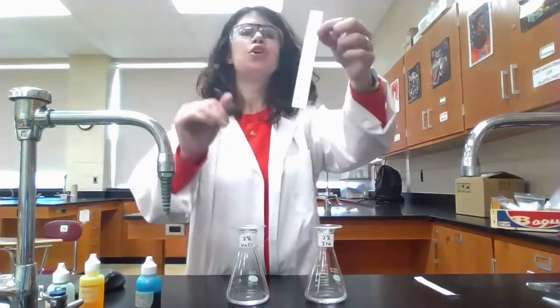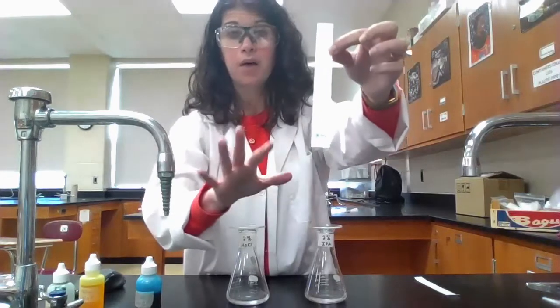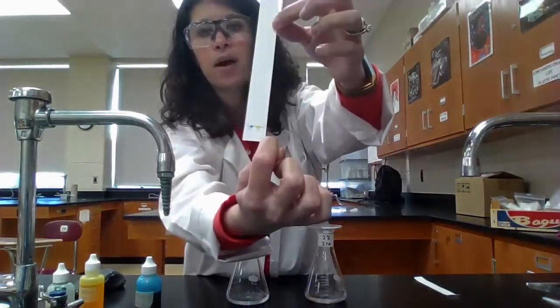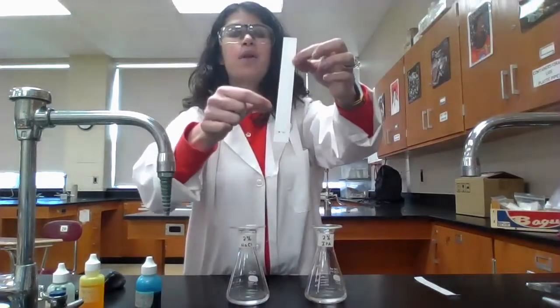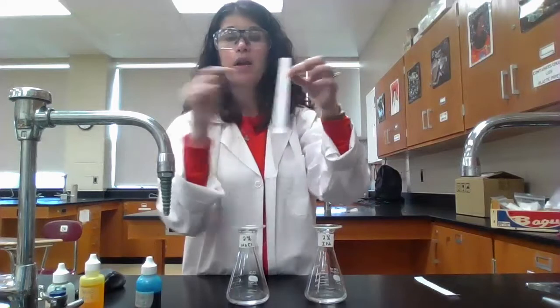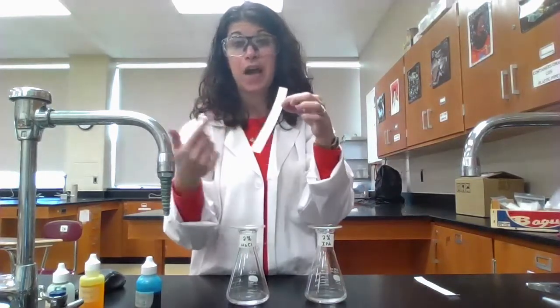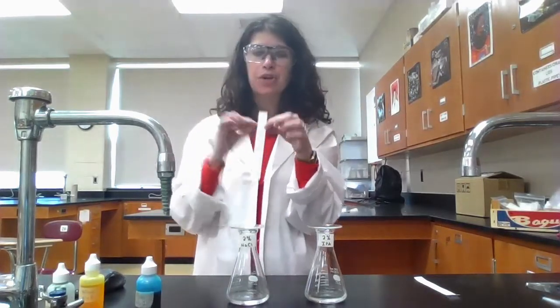Once the paper is in, it's really a question of being patient and watching the solvent travel. On the paper, I drew a line with pencil — not pen — to mark the starting point. When I take it out of the chamber, I'll also use a pencil to mark how far up the solvent traveled and how far up each dye traveled, and use those measurements to calculate my RF values.